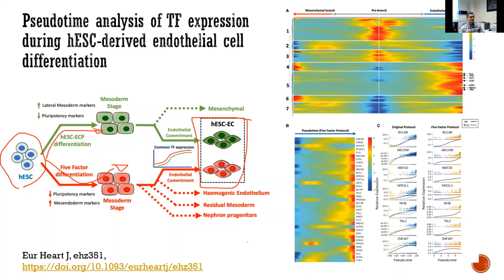That's how they can reconstruct the profile to discover genes with different patterns, and plot those heat maps to find the change of gene expression following the two different paths.